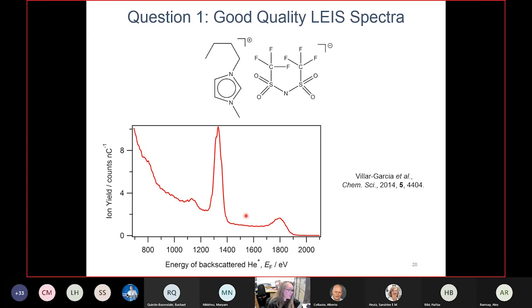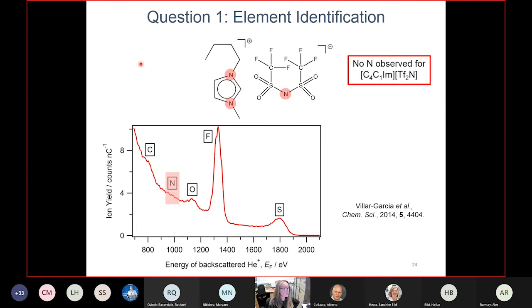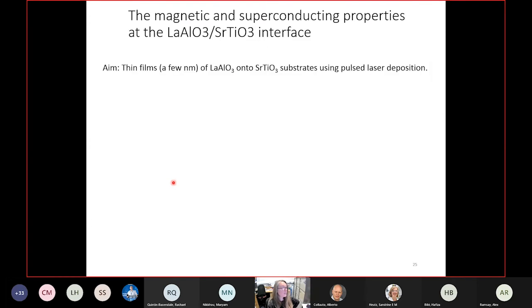These surface peaks mean that the element is clearly on the outermost layer. So what we're seeing exposed to the surface is fluorine. The carbon is hidden in a background signal, so not very clear, sulfur and oxygen. No nitrogen is identified, that's sort of below the surface.